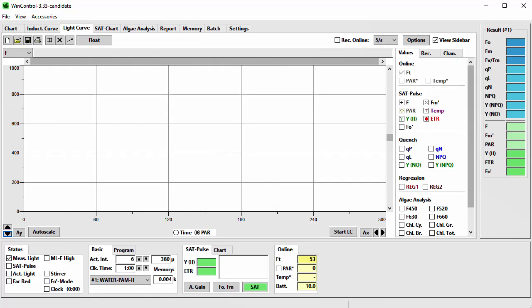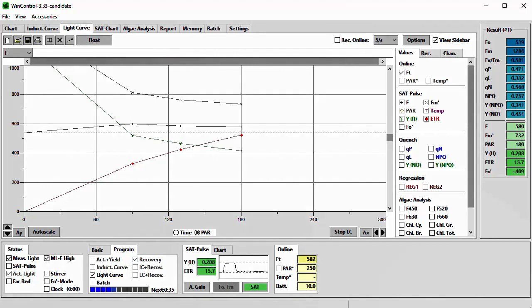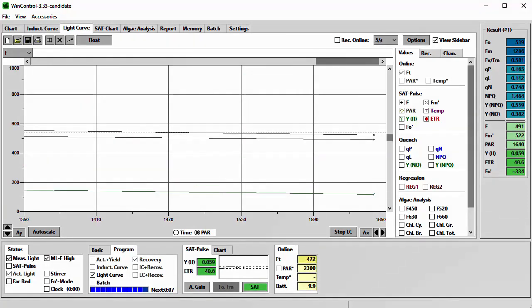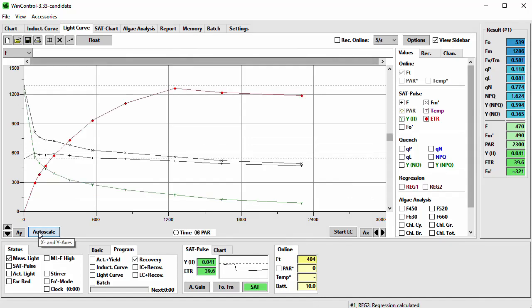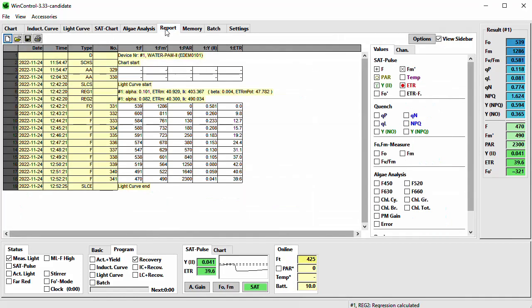I will now start this protocol. I inserted a new dark-adapted sample. First I do the automatic adjustment of the detection range by pressing the Auto Gain button. Now I can start the light curve on the Light Curve tab — I could alternatively use the checkbox in the status panel. I time-lapsed the sequence. The light curve fit according to Platt et al. or Jassby and Platt can be shown by activation of the REG1 or REG2 checkboxes in the sidebar. If you switch to the Report tab, you will see that for all light curves, the fit parameters will be listed above the stored data of the measurements.